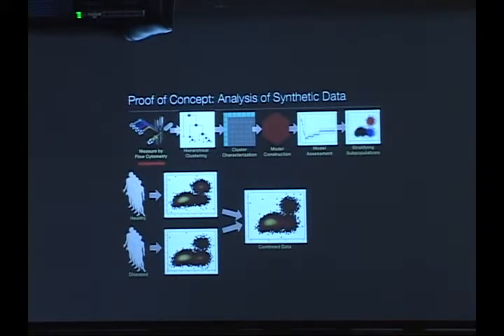Well, because you're combining them all together, it's looking over the space of all the potential clusters in all of your samples. So if there is one particular cluster that exists in a subset of your patients, it will consider that cell subset across all of your patients. It just won't be a great predictor for all of your patients.